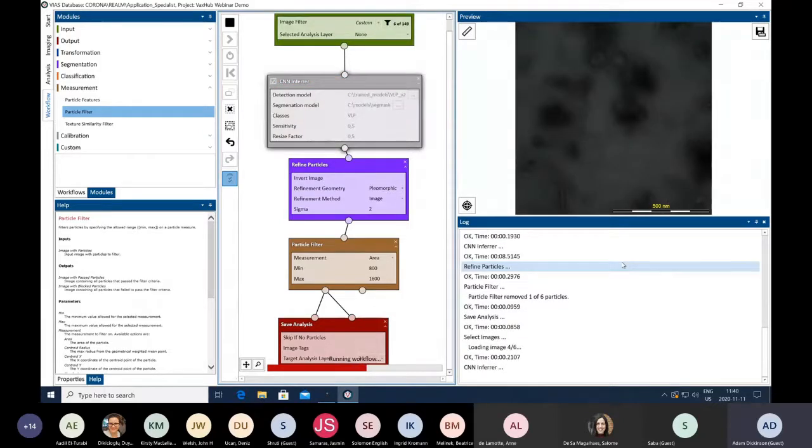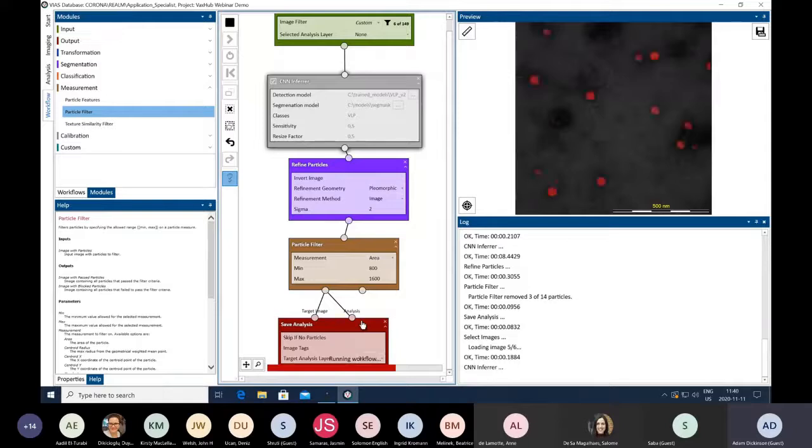It's working quite well. Some of these irregular objects may still come through depending on their size, and you could apply another filter for potentially elongatedness. Obviously any object that's more crescent shaped will have a higher elongated value than the VLPs that are going to be more circular.